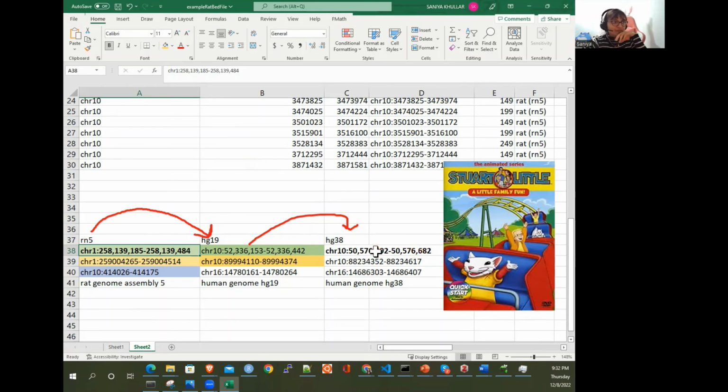So this seems to be a little shy of 300 base pairs. So that's what this mapping does. We can convert this in a rat to this in a human of the build that we want. And this to this and this to this. We just had to go through this intermediate. So that's the way that I recommend looking at it.